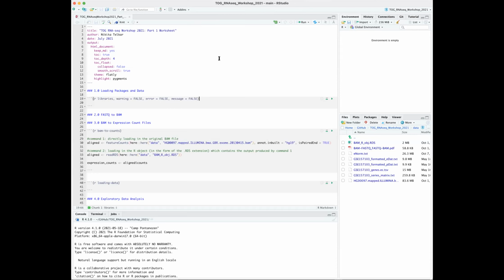Sorry, I have a question. Yes. It looks like you don't have to code to align and everything to the genome reference. When you call that, it's all done by that feature option, featureCounts. Yes, so if you do have a BAM file, which is already aligned, this is the command that we'll be using. But to produce the BAM files, those were the steps that I was going through, from FASTQ to BAM. Is that clear, or should I explain more?